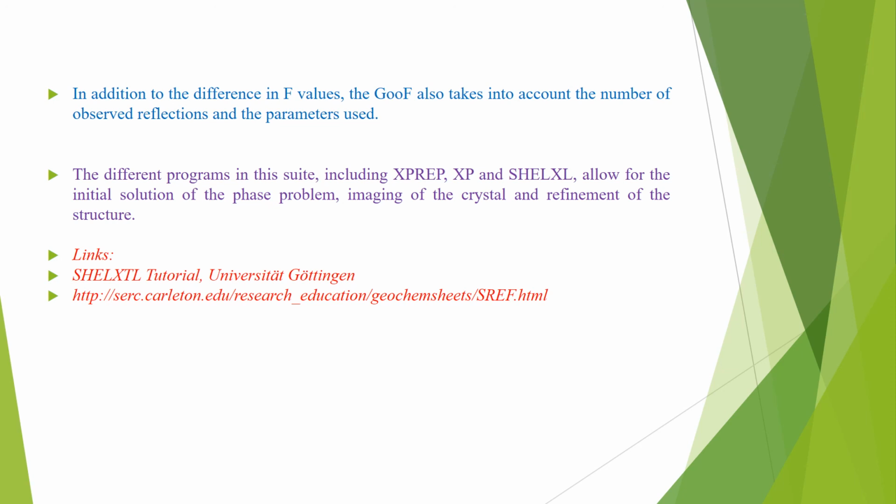The software that is used in the refinement of the structures: structure refinement is greatly aided by software packages. Probably the most widely used package of software is the SHELXTL program suite.